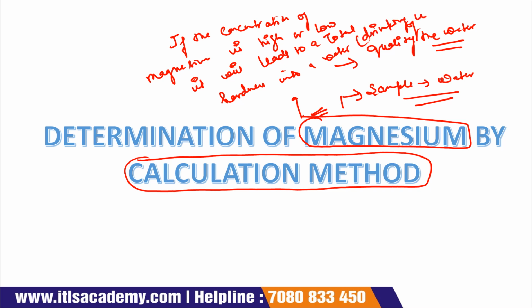So the concentration should not be too high and not too low.